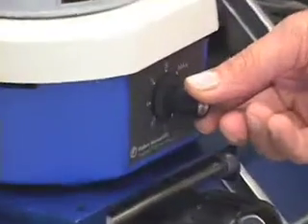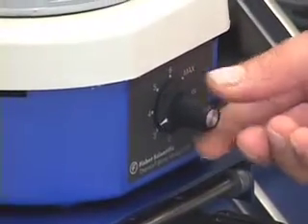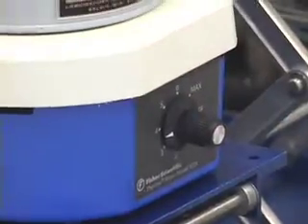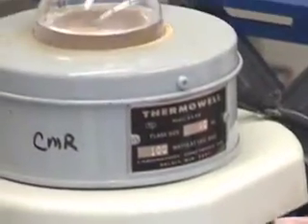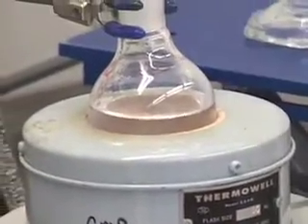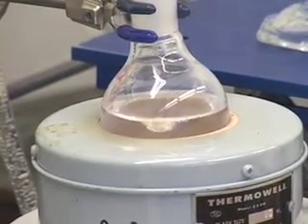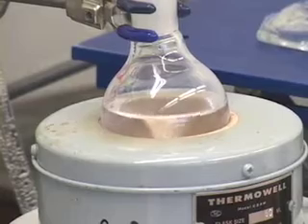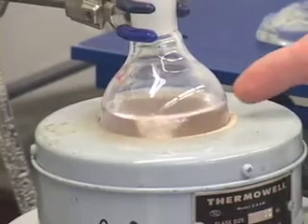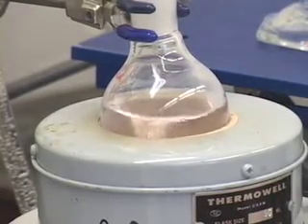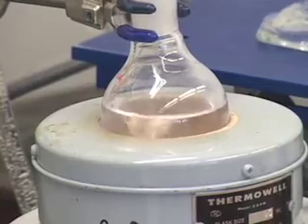Let us turn the stir bar on and notice that the magnetic stirrer is stirring the liquid and you can see a vortex in there. You don't want the vortex to be jumping too rapidly.